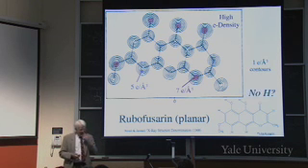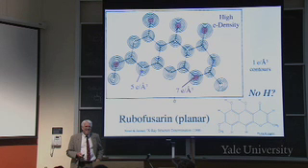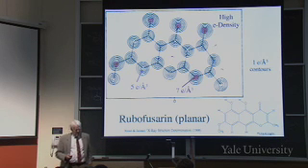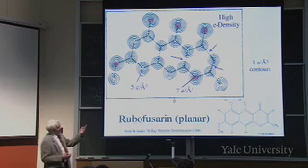Okay. Why are there no hydrogens? Because they have hardly any electrons compared to the others, right? So they're a very weak thing. Okay, now, those are bonds. You can see them there.